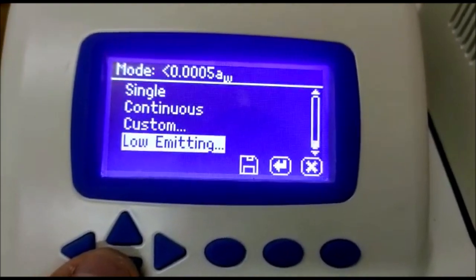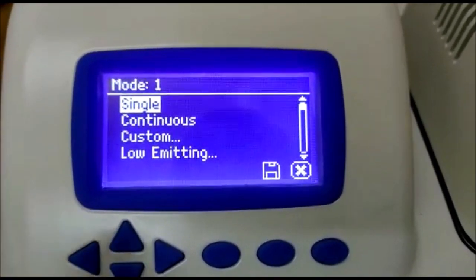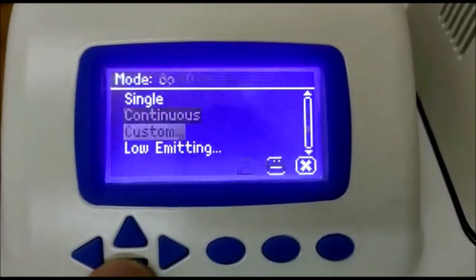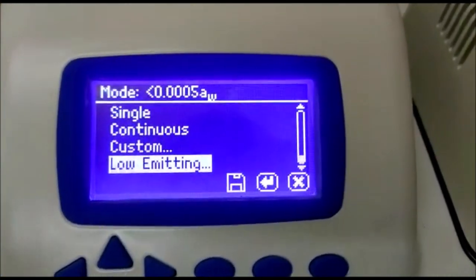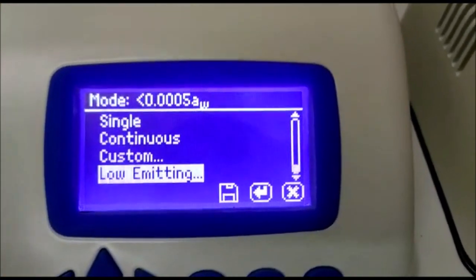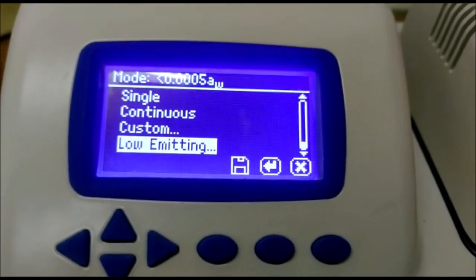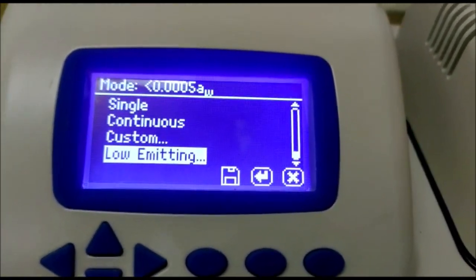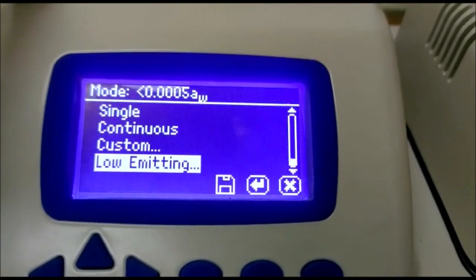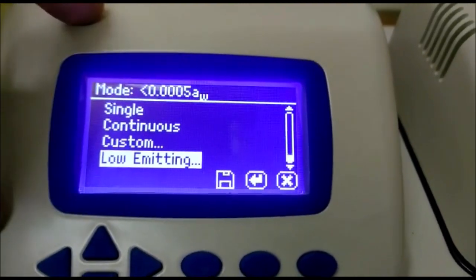We have low emitting mode. Low emitting mode basically is for sample which emits moisture, which emits water at a very slow rate. There is one more test to introduce in this Aqualab 4TE which is ISO 18787.